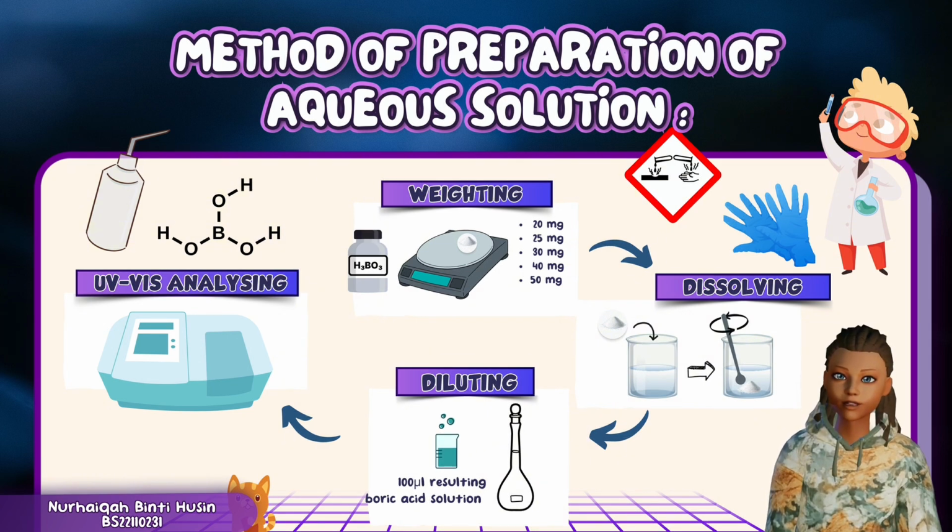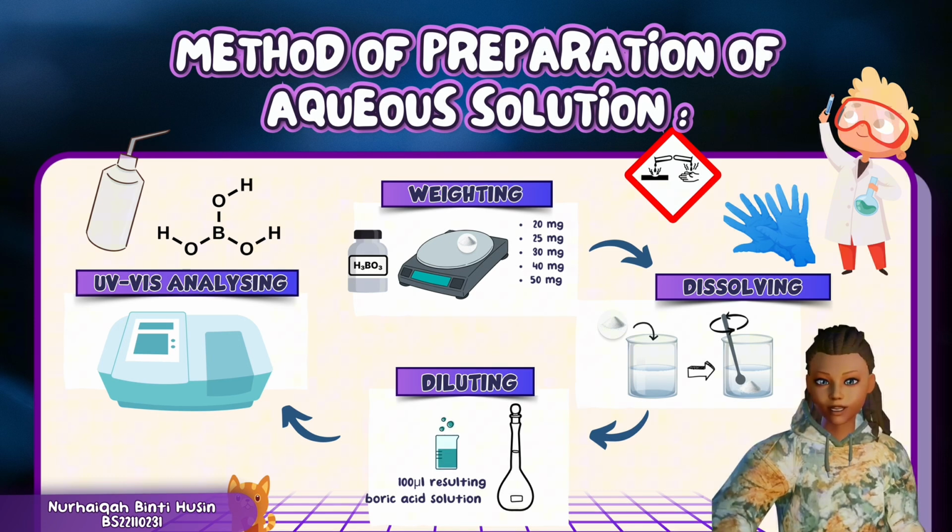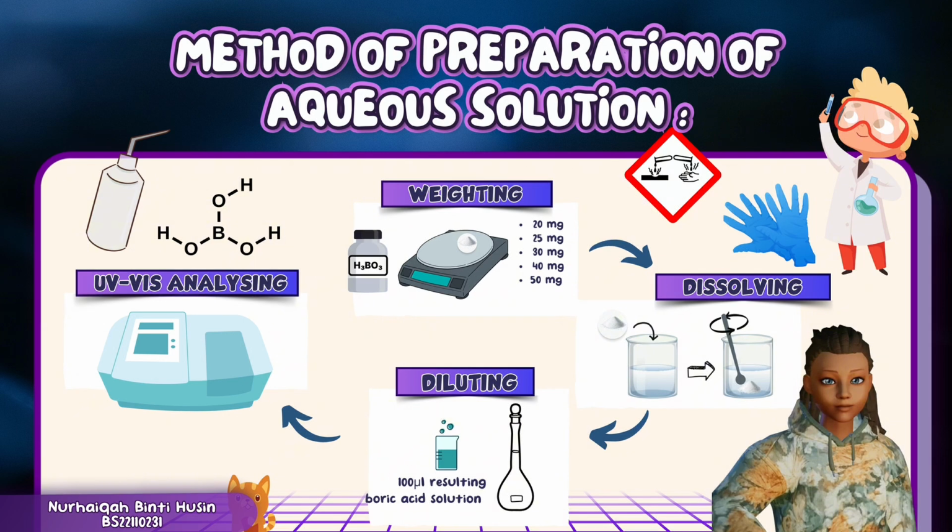It is important to handle boric acid with care. So, wear protective gloves to avoid skin contact that can cause skin irritation.